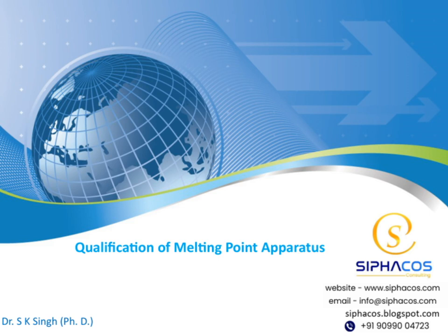Today, we will be exploring the qualification of melting point apparatus, presented by Dr. S.K. Singh, who holds a PhD in this field. Over the next few minutes, I will guide you through the key aspects of this important instrument. We'll cover its significance, how it works, and what makes its qualification essential. So, let's get started and delve into the fascinating world of melting point determination.